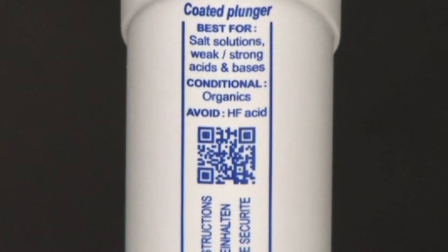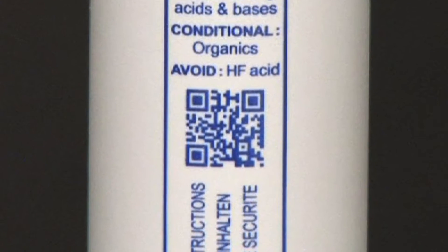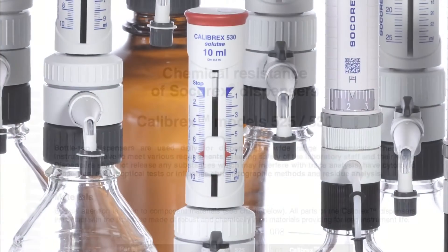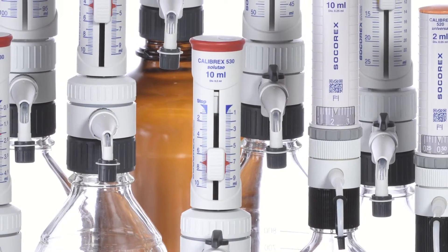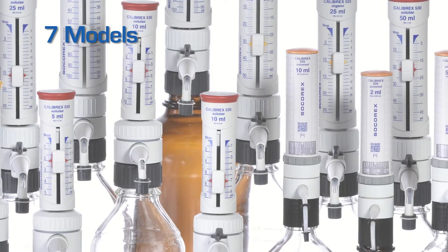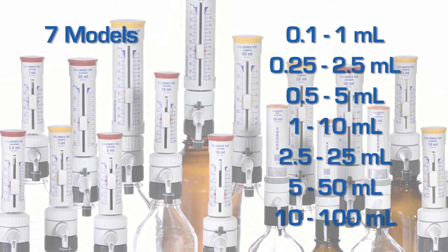Both Calibrex dispensers exhibit excellent chemical resistance and come with a QR code that enables instant access to a chemical compatibility chart. Both the Calibrex Organo 525 and Salute A530 are available in 7 volume ranges from 0.1 milliliters to 100 milliliters.